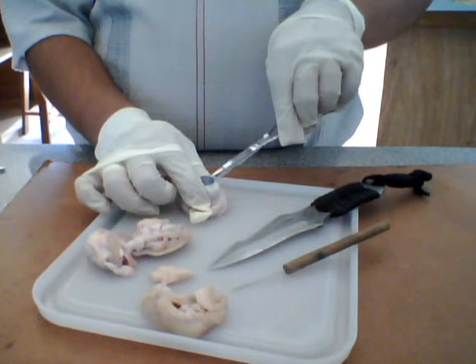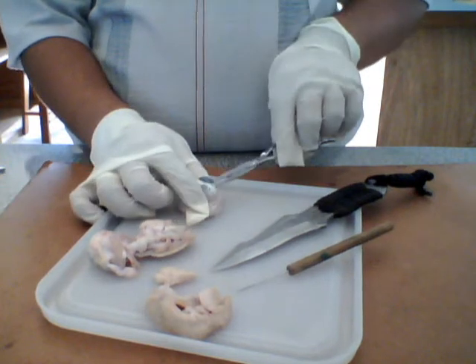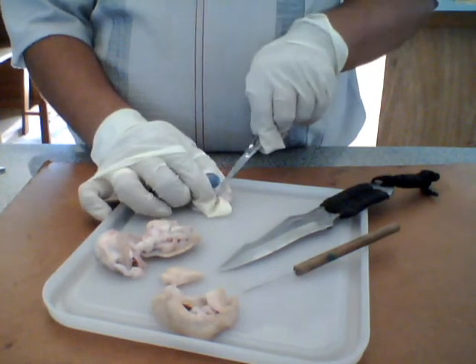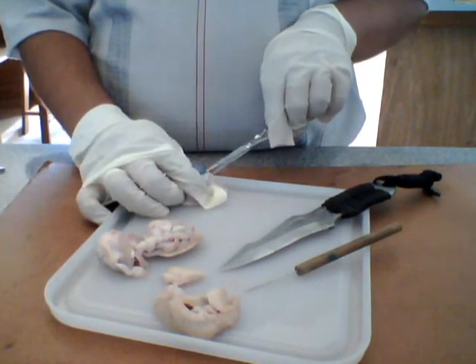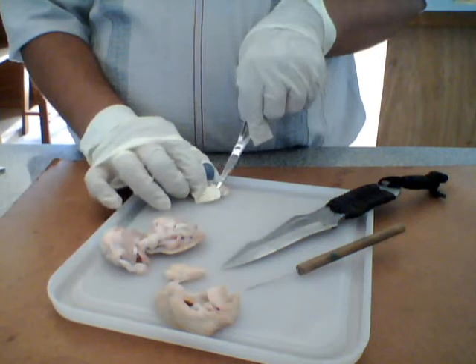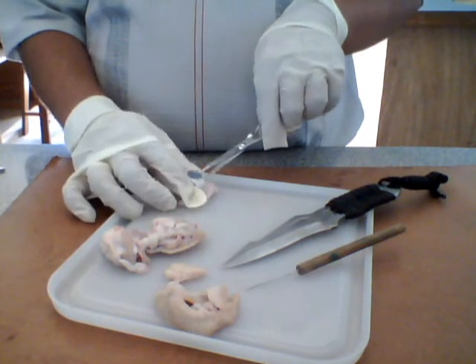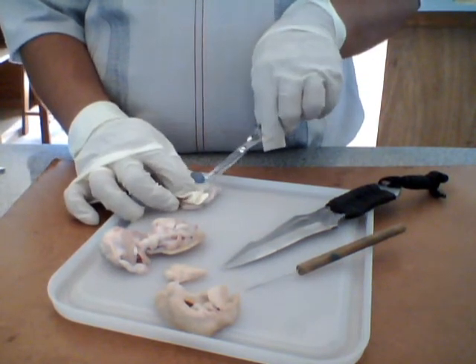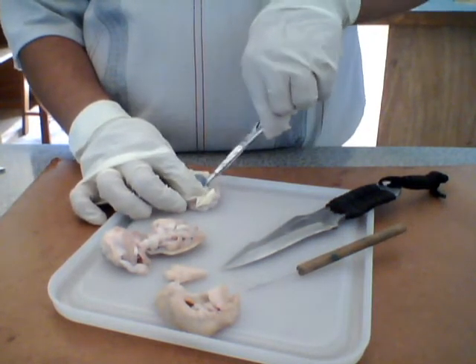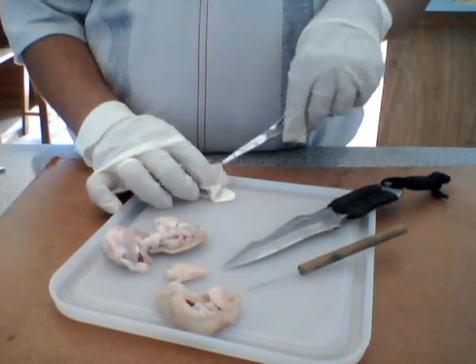So what we need to do is make an incision around the iris — see where the dark region is — we will go around to remove this part, because when it pops you have the aqueous humor coming out.